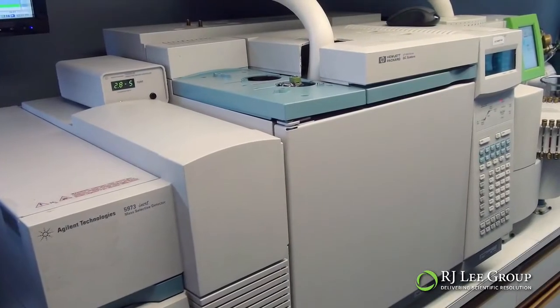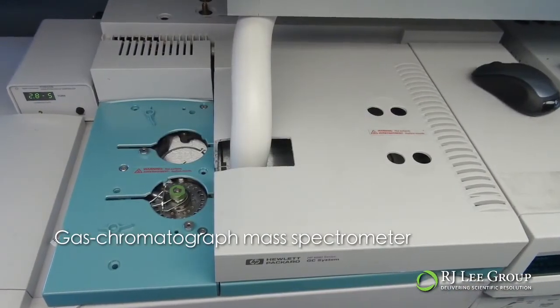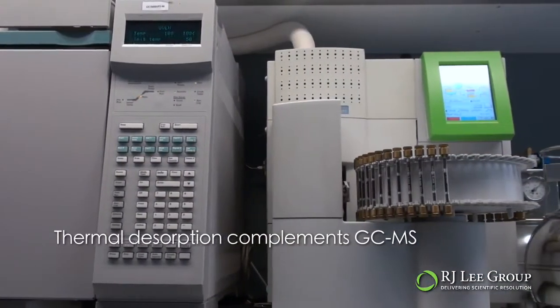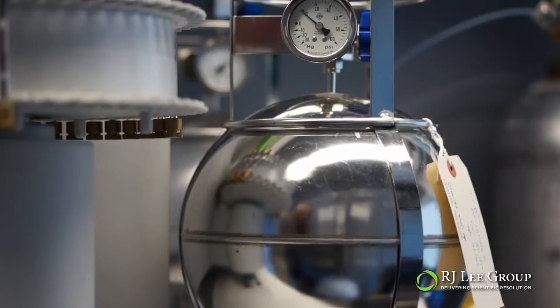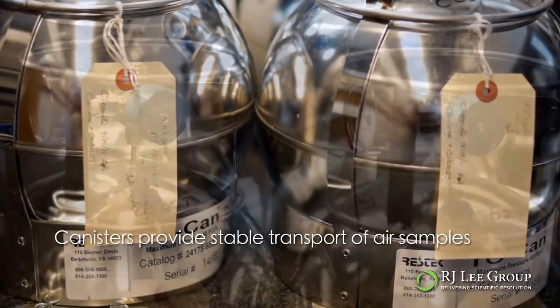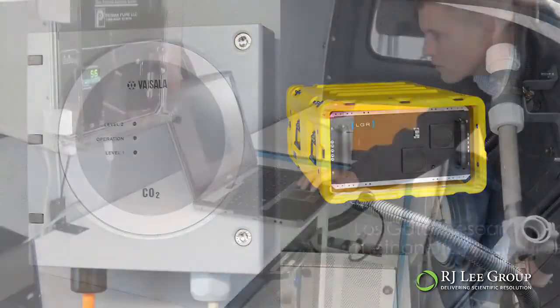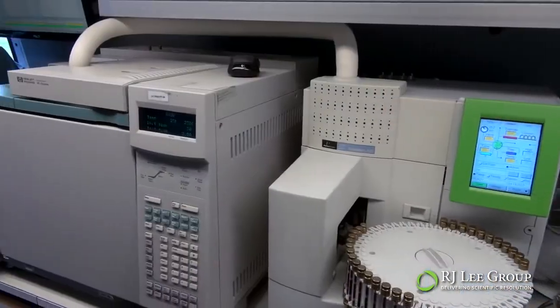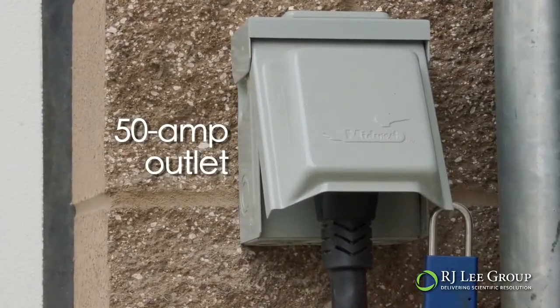Supporting the PTR-MS system is a gas chromatograph mass spectrometer which follows EPA analytical methods with high sensitivity and confidence. The GCMS concentrates samples using thermal desorption, which provides automated and repeatable analysis of up to 50 tubes of collected samples. Whole air samples can also be stored in electropolished stainless steel canisters that preserve the sample's integrity during transportation. A carbon dioxide sensor and LGR methane analyzer provide precise CO2, methane, and carbon isotopic measurements. All of these instruments are powered by either the van's electrical generator or by a standard RV 50-amp power source.